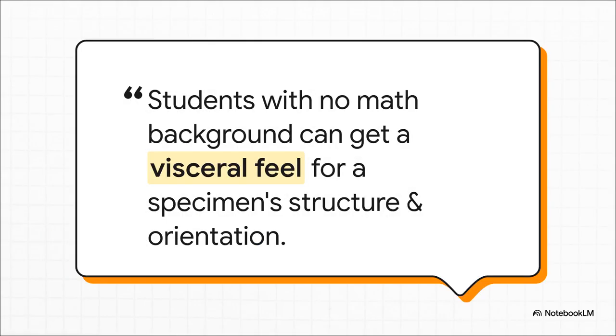And you know, this is about so much more than just making a cheap version of a microscope. It's about building intuition. The creators themselves said the goal was to give students a visceral feel for what's going on, to let them play and explore and really get it without needing a deep background in advanced math.